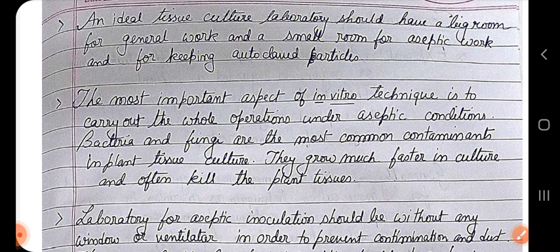Bacteria, fungi are the most common contaminants in plant tissue culture, and they grow faster in the culture medium also, because the culture medium that we are using for growing that plant tissue, that same culture medium is very, very good for growth of the bacteria and fungi as well. So it should be protected from them.